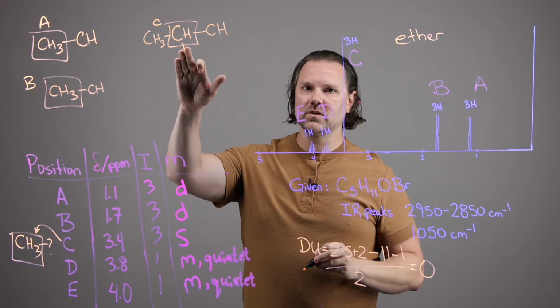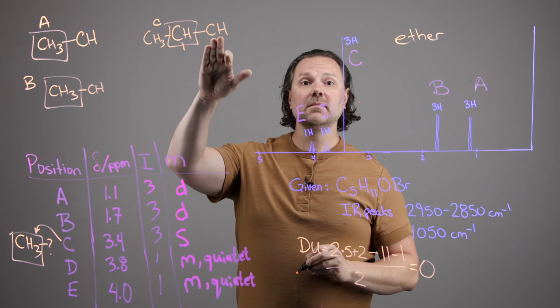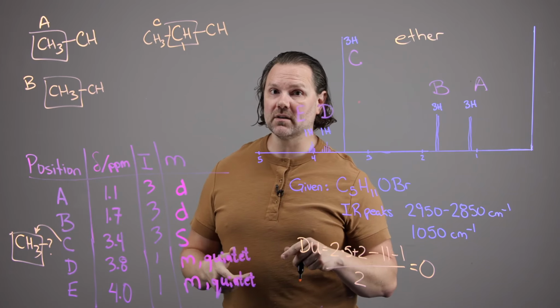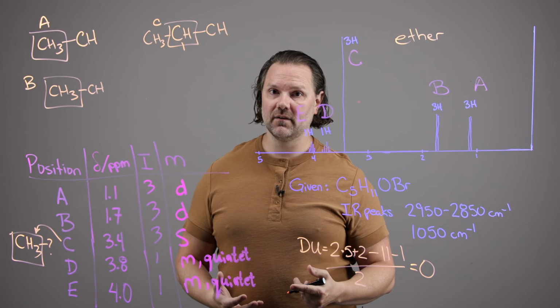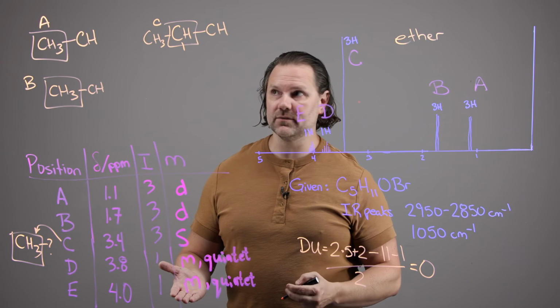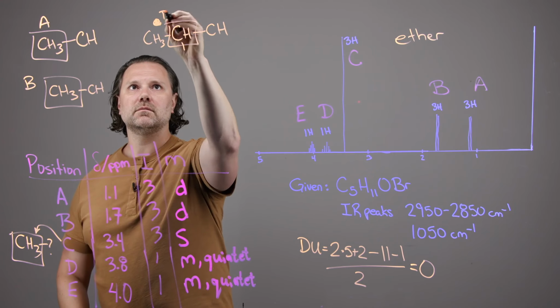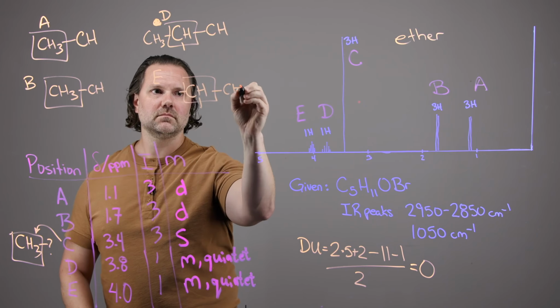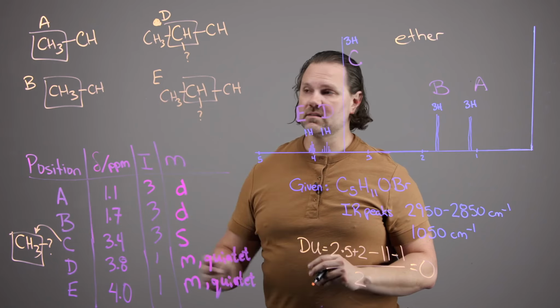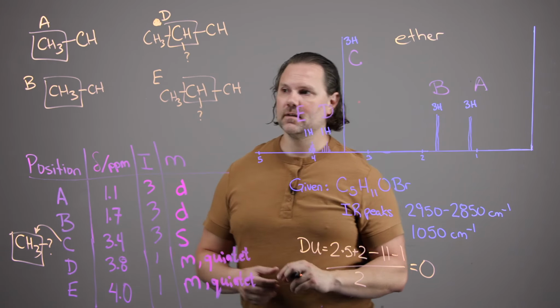So a CH3 group with 3 and 1 making 4 neighboring protons, but we do need one more bond to satisfy the octet of that carbon. E is in a similar environment. And there we have the pieces of our molecule.